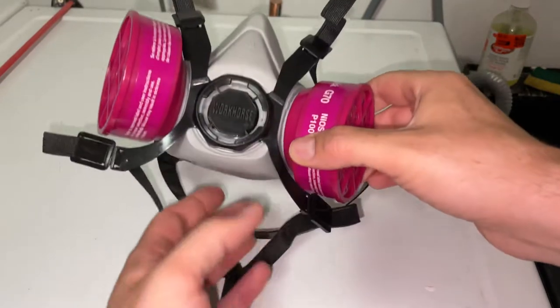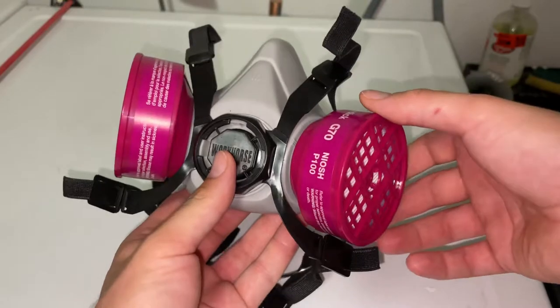Hey there folks, in today's video I'm going to be showing you how to remove and replace the cartridges on your respirator mask here.